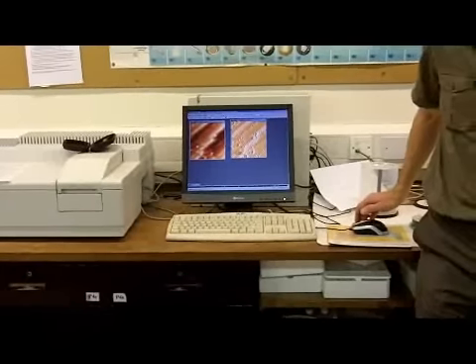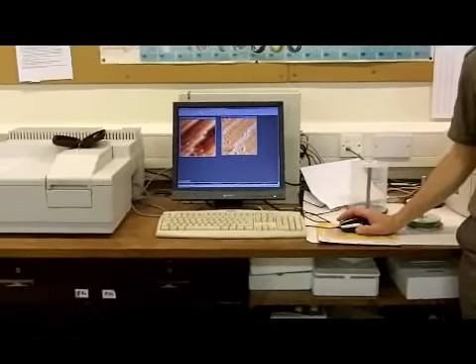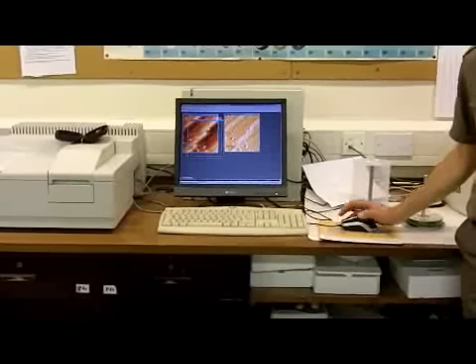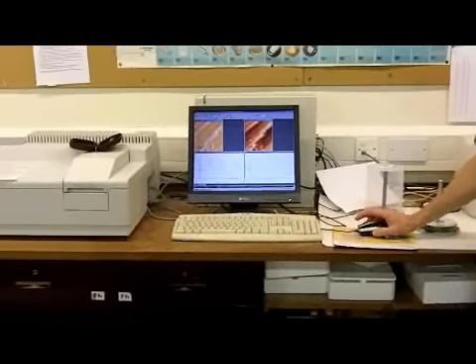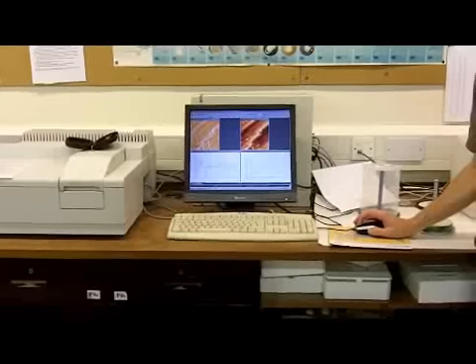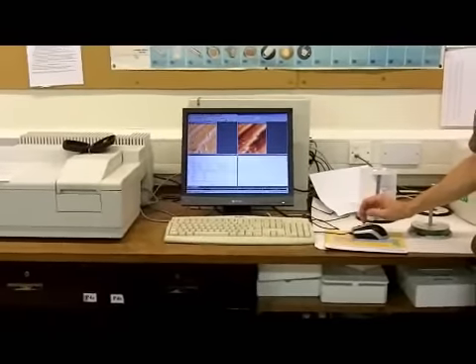Right, so crosshairs appear, so you can choose where the profile is going to start. You can move this later, so it doesn't matter too much, but let's start on this terrace up here. So you click with the left mouse button to start, drag the cursor around, and you can see the profile is developing as we move it. Click with the right mouse button to finish it.